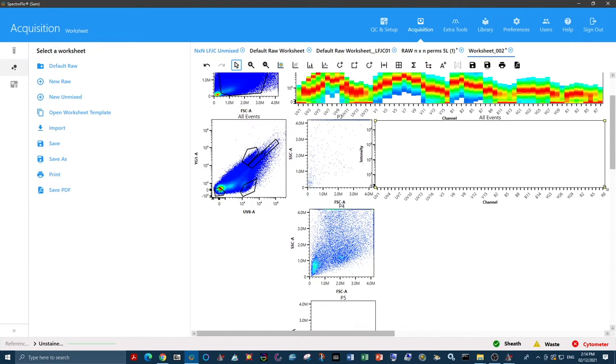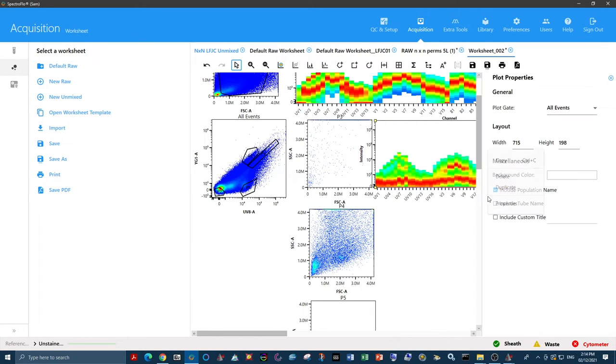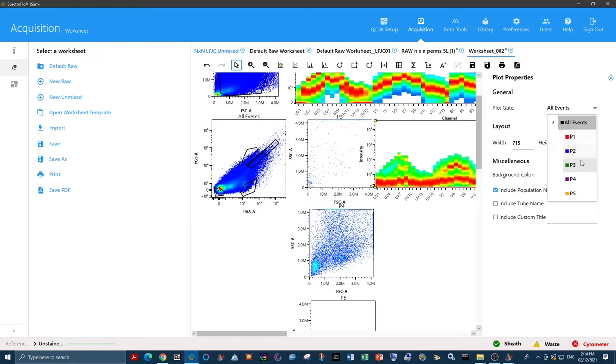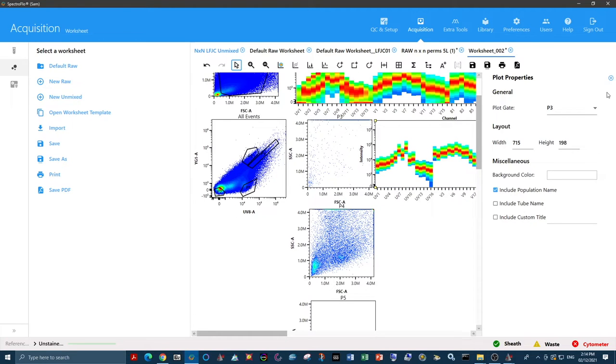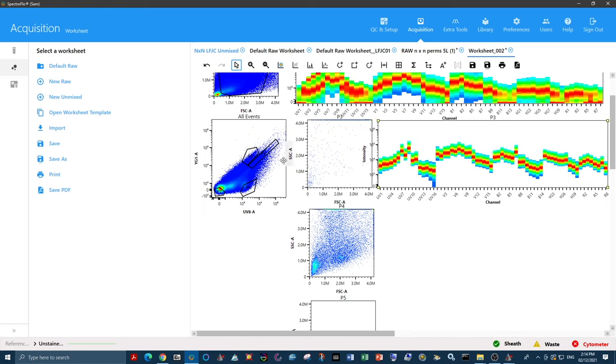If we put a spectral plot alongside this scatterplot, and we only plot this P3 gate that we've created, we can see the high yellow-green signal indicative of eosinophils. We would call this spectral autofluorescence eosinophil-like.